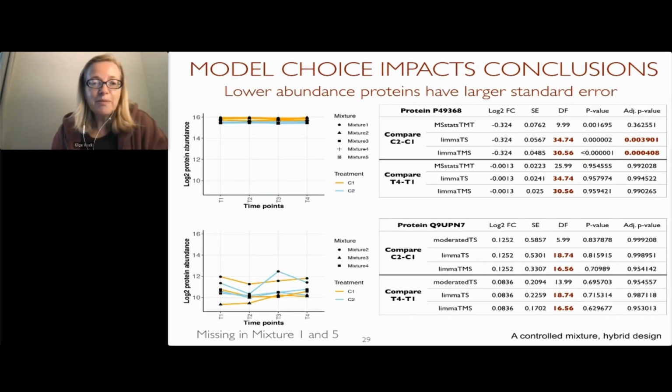And just in terms of comparisons, some other methods that you may have heard of, such as limma, are not able to separate this variability in so many different levels. And as a result, they cannot distinguish the amount of information available to compare conditions from the amount of information available to compare times, given multiplexes. And so here are some examples.